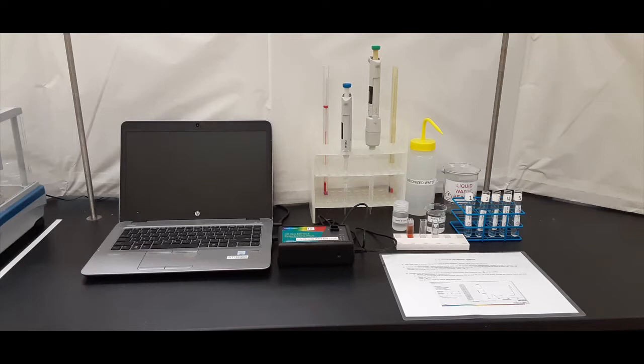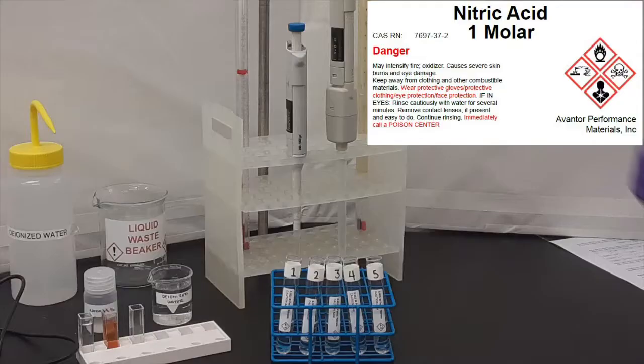Now there are a few changes in the lab, changes made for COVID, so I want you to look carefully at this. You have 3 cuvettes. One of them is already full. That's your high standard. Another one is full of water, and a third one is empty. That is your working cuvette. We'll show you how that goes in a minute.